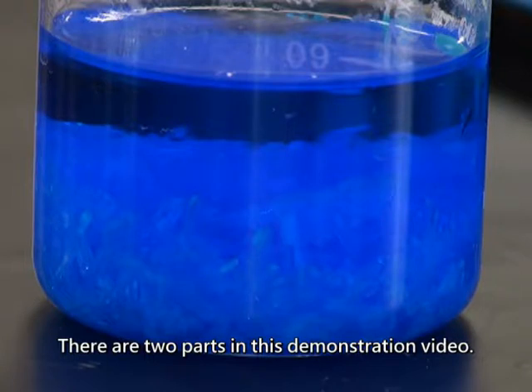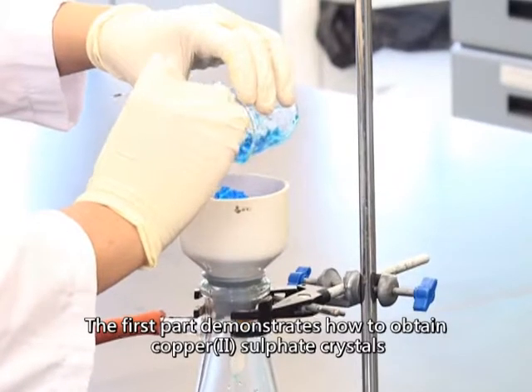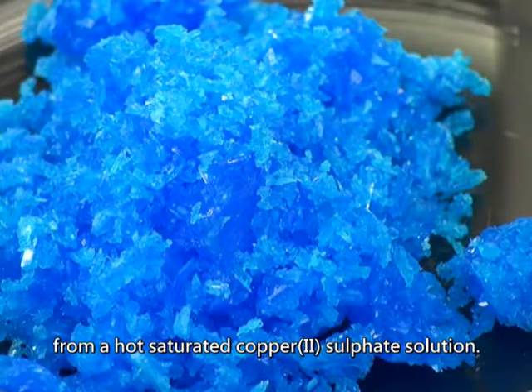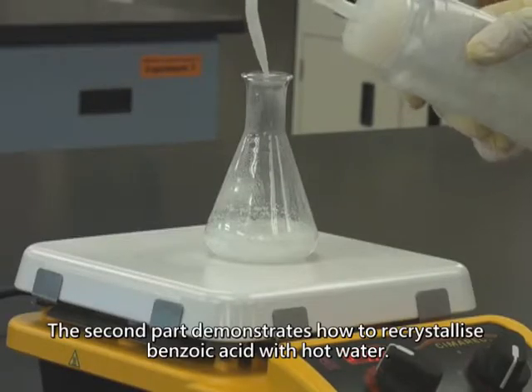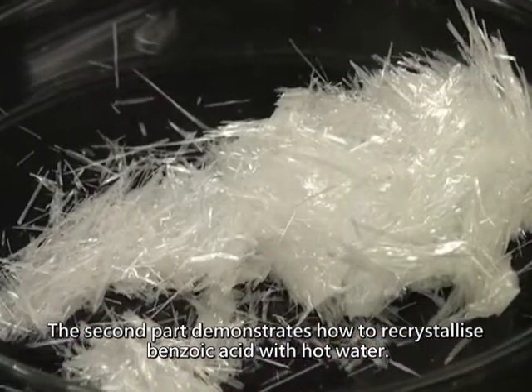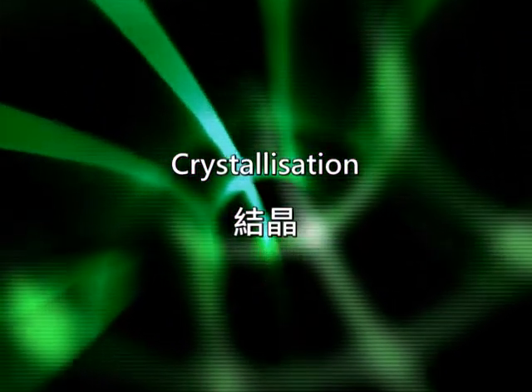There are two parts in this demonstration video. The first part demonstrates how to obtain copper 2 sulfate crystals from a hot saturated copper 2 sulfate solution. The second part demonstrates how to recrystallize benzoic acid with hot water. Crystallization.